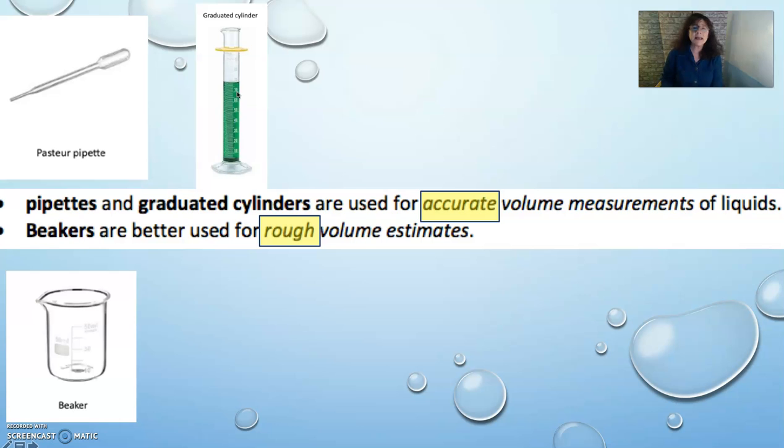And in fact, your lab has a great video attached to it on how to use the meniscus for most liquids that you'd put into a graduated cylinder. And in those liquids, the meniscus, or the shape of the fluid, is actually concave.